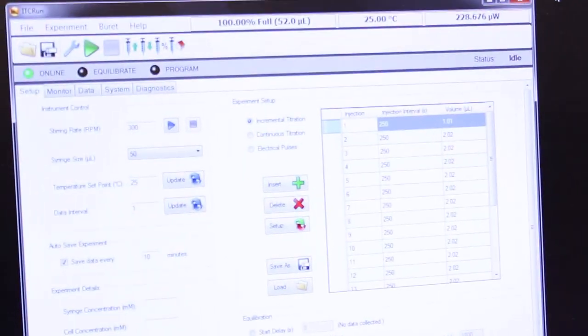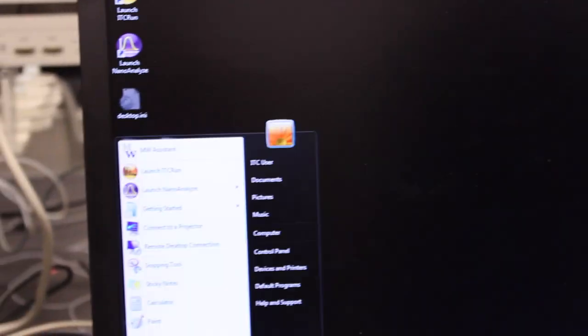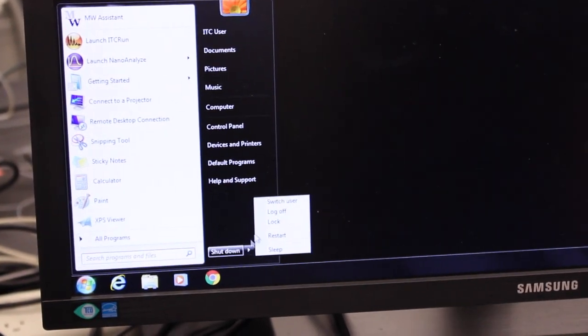First thing you should do is close the ITC run window, log out, and log in with your own account. Use your net ID and your net ID password.